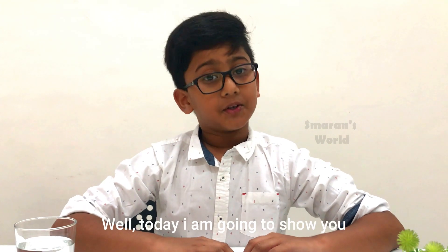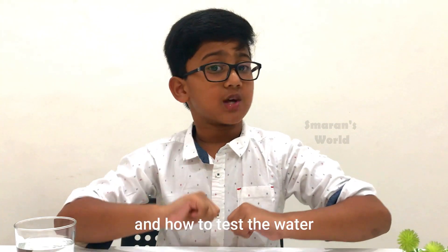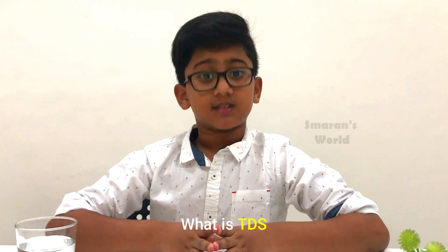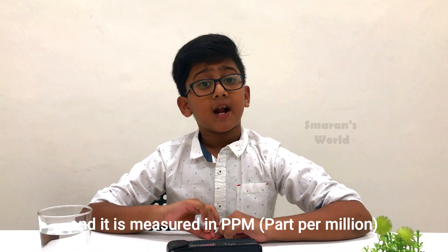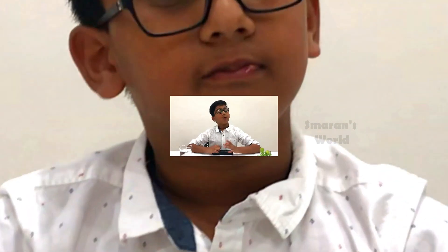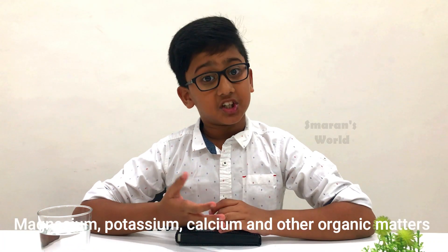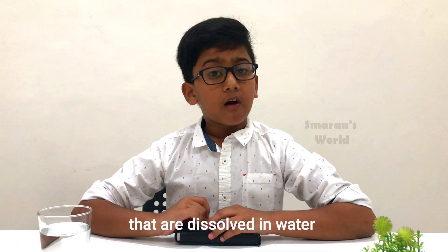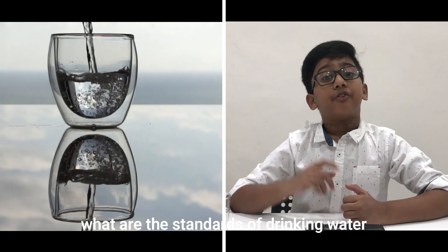Well, today I am going to show you how to use the TDS meter and how to test the water. Let me explain what TDS is. TDS stands for total dissolved solids, and it is measured in parts per million, PPM. Water may consist of chemicals like magnesium, calcium, potassium, and other organic matters that are dissolved in water. Let's quickly check what are the standards of drinking water.